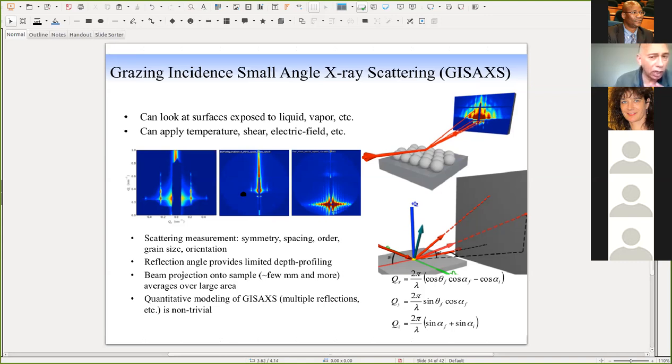In this case, you're getting more like the crystalline lattice, where there's stuff around it and there's some periodicity in the material, and you can see that with the spacing here. And in fact, you can see that it's a couple of layers thick because you've got some extra features in this direction. So anyway, GISAXS is another experimental approach people seem to enjoy and get something useful out of.